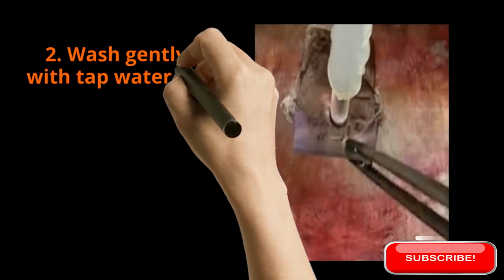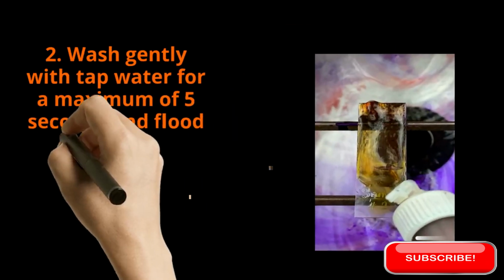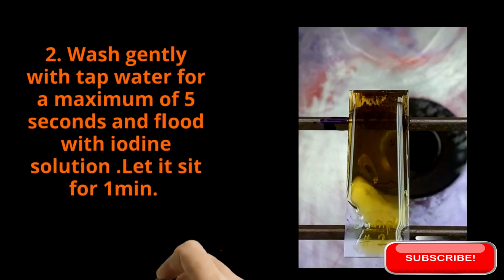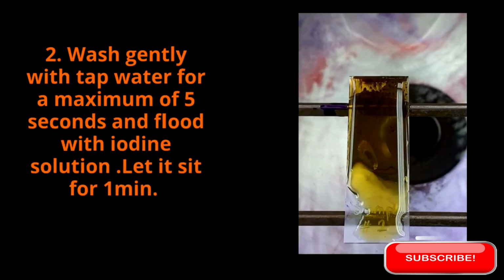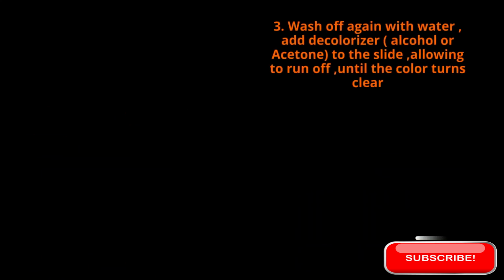Second, wash gently with tap water for a maximum of 5 seconds and flood with iodine solution. Let it sit for 1 minute. This acts as a mordant and fixes the dye. Wash off again with water.